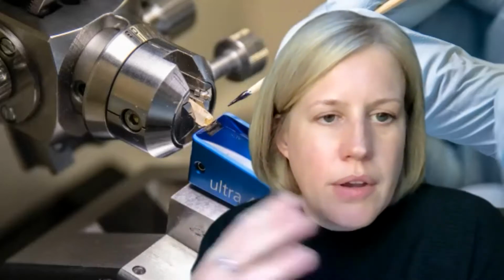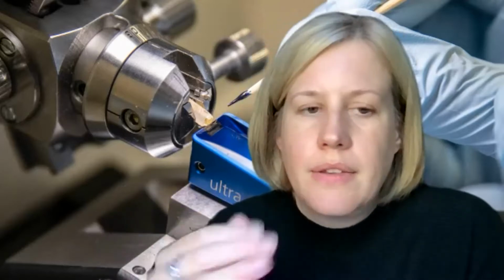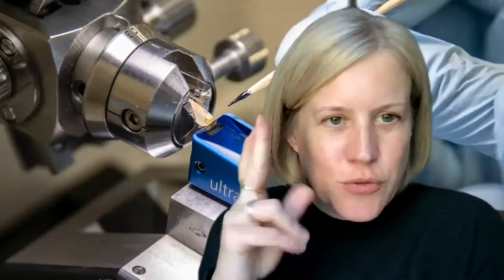And at the moment, the other thing is there's a high pressure freezer in the process, which, as you know, can be finicky and require a lot of repetition to get the perfect sample. And then of course, ultramicrotomy, which is hard and limits these things to expert electron microscopists. So we're going to try and take all of that out when we develop the pipeline and make it as easy as possible. And it's a big challenge, but we think we have the ideas and the people on the team to do it. So check back in 2 years and fingers crossed.